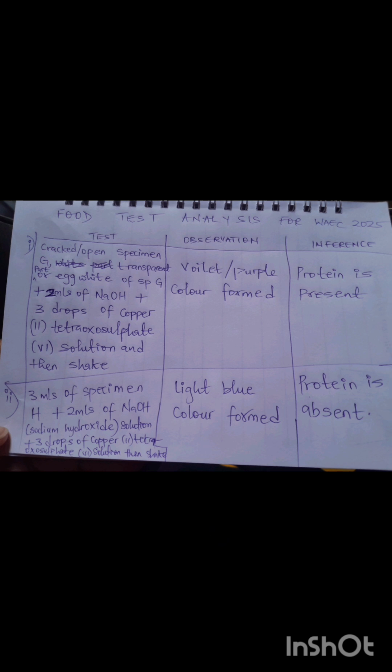Now when they tell you to crack it, because we've already told your school to provide a petri dish, you can crack it and put it inside, and a syringe. The syringe there is for you to collect liquids, just like in the hospital they use a syringe, but there's always a needle attached to it.